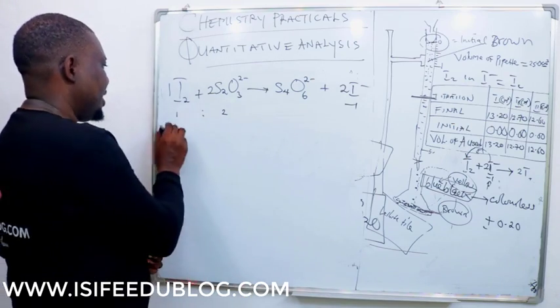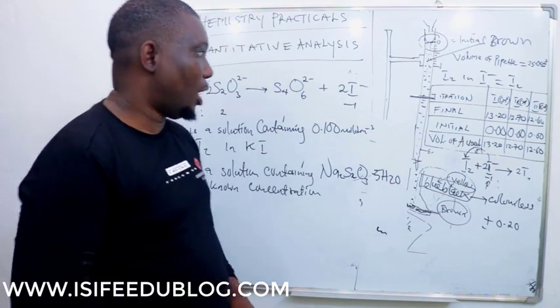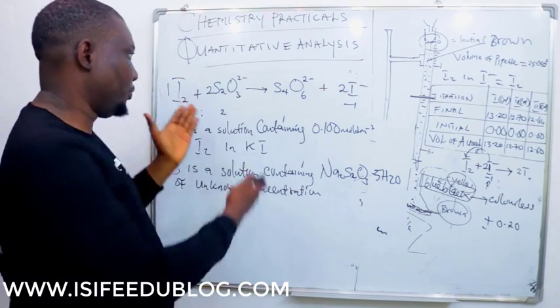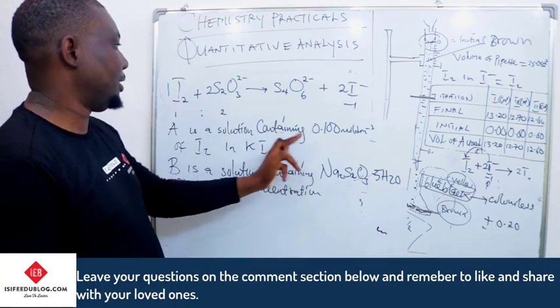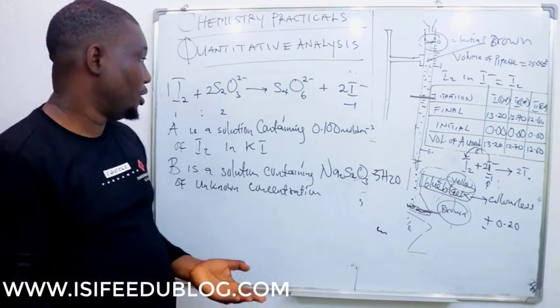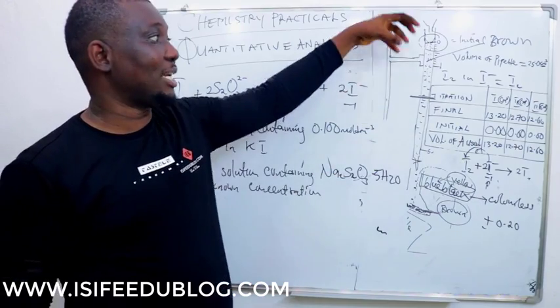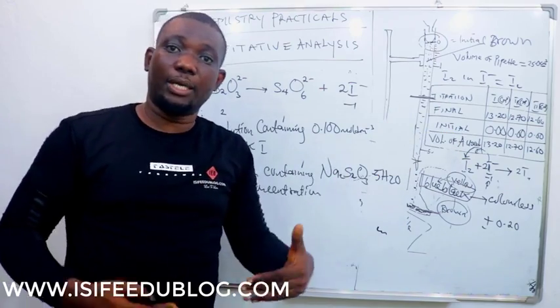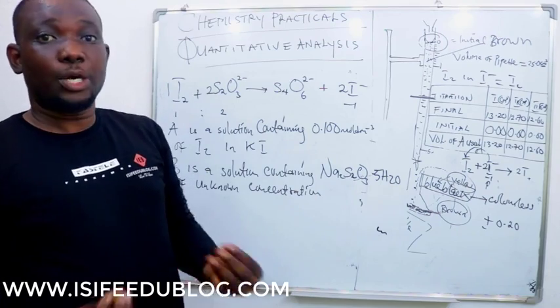Okay, so most times we see questions this way. An examiner will say A. Okay, now, so we have the table obtained for this reaction. We already have the equation, balanced. I think the examiner will always give you the equation of this sort, so you don't have to bother yourself. So this is A, containing the molarity, which is known. The concentration is known in mole per dm cube. That is why A is poured into the burette. So its standard solution is known. Its concentration is known. Okay, what is a standard solution? A solution whose concentration is known accurately is a standard solution.